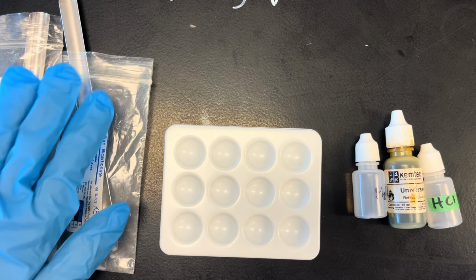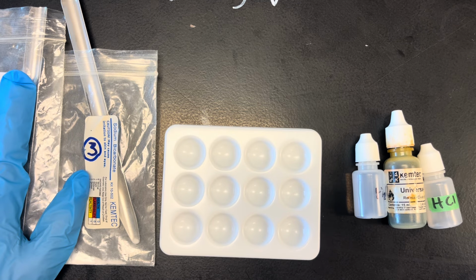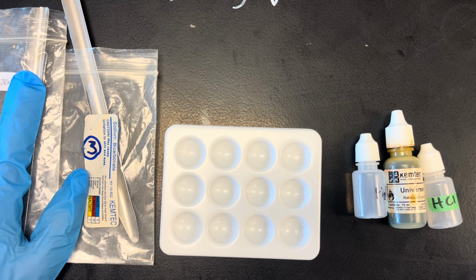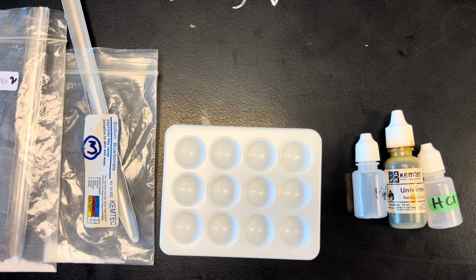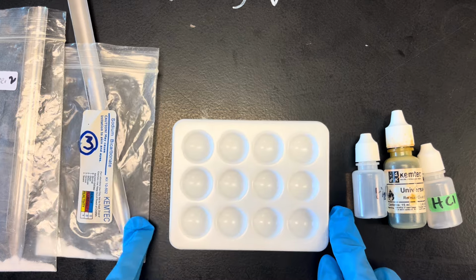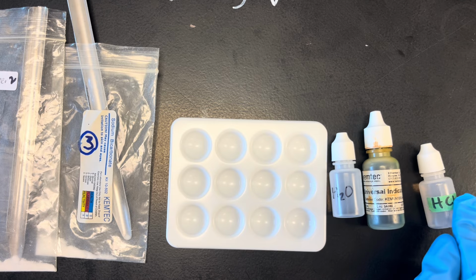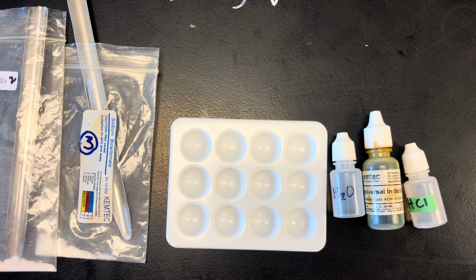So that you don't have to swap so much during the lab, I'm going to have you test 3 substances, and then when you're finished with those 3 substances, you'll test the other 2. That will also give you enough space in your well plate or depression plate. You'll have 3 reagents: water, universal indicator, and HCl, which is acid.